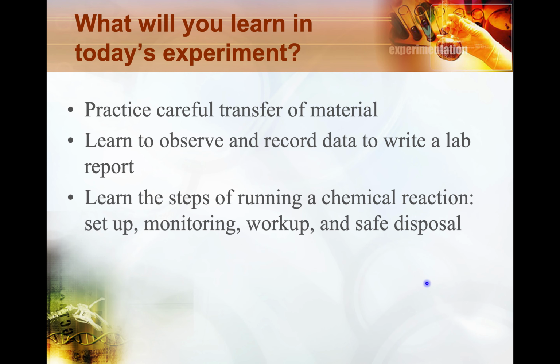As I mentioned earlier, you're setting up a reaction, and there's some key steps that you'll be learning, including the setup. What flask do you use? Are you heating it? What do you need to be concerned about when you're heating it? Next, you'll be monitoring the reaction. So how do you know how far along the reaction's progressed? Has it finished yet? Then the workup, which is how do you purify the materials? And finally, the safe disposal. At the end of the experiment, how do you then safely put the correct materials into the correct waste containers?